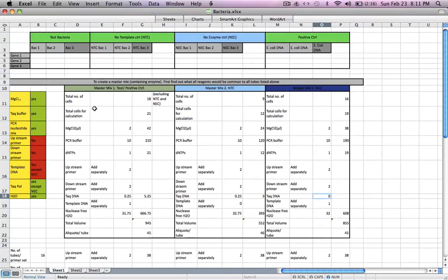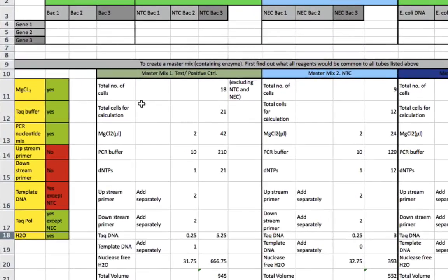Now, for the sake of making our life easier, let's imagine that if you want to assemble a PCR assay system for bacteria 1, 2 and 3, or let's say for gene 1, 2 and 3, you are adding equivalent amounts of magnesium chloride, nucleotide mix, forward and reverse primers, let's say 1 microliter each or 2 microliters each, in case of all three genes, right?